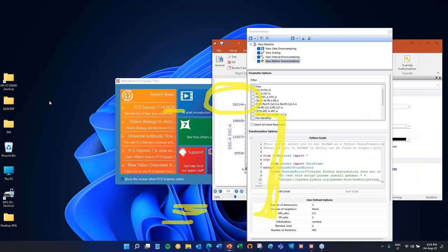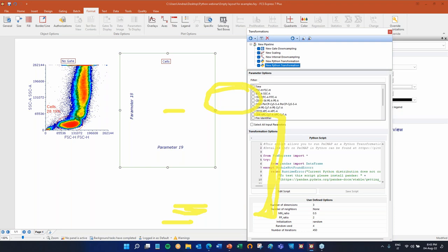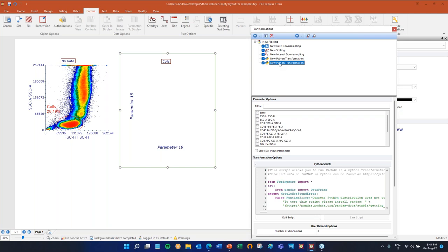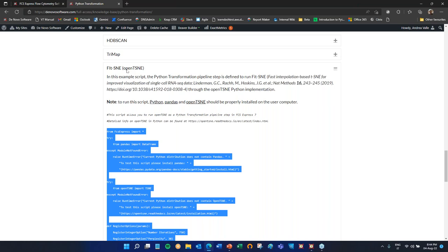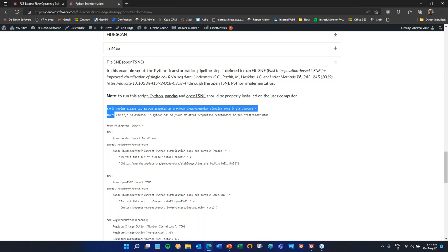Let's add another Python transformation. Worth mentioning: since you might want to add multiple transformations, when they're added from the categories they have meaningful names, but Python transformations are just called 'Python Transformation.' So for clarity, right-click and rename — this one is 'PacMap' and this new one will be 'FITsne.' Let's go back and copy the FITsne script, then clear the script area and paste it with Ctrl+V.